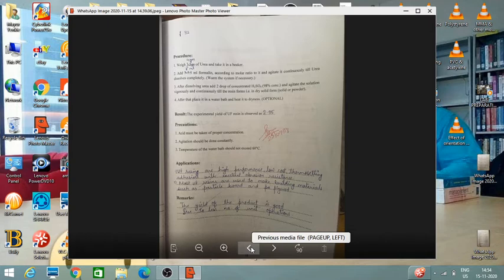First you take the weight of the urea, 4 grams, then the volume of formalin, 8 ml, and the volume of sulfuric acid, suppose 3 drops. The yield of the product you got is 9.7 grams, just by weighing. The color of the product will be white, volume of water 10 ml, and kinetics about 3 minutes or 13 minutes, whatever.